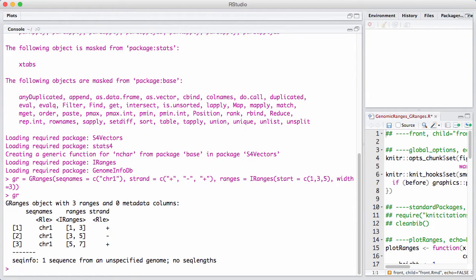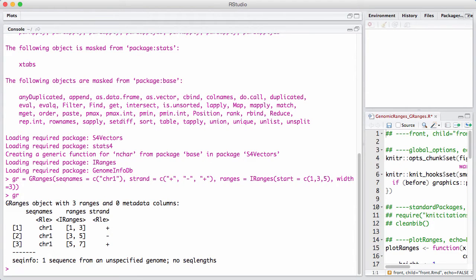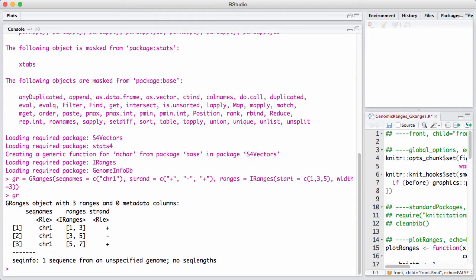A lot of the things we have learned about IRanges carry over directly to GRanges. We just have the additional bookkeeping of the chromosome and the strand. But there's a couple of new operations that has to do with the fact that things now have a direction because of the strand.